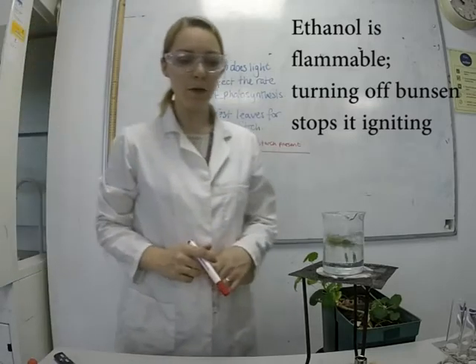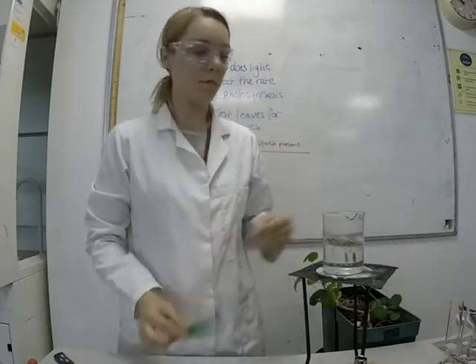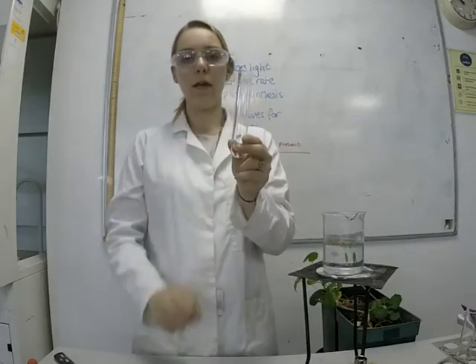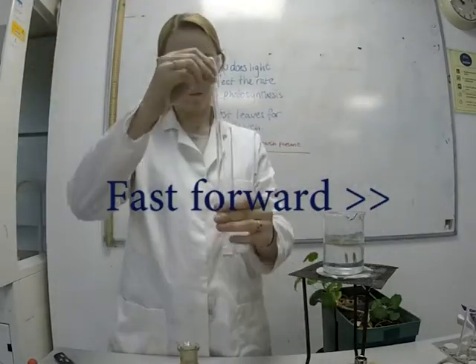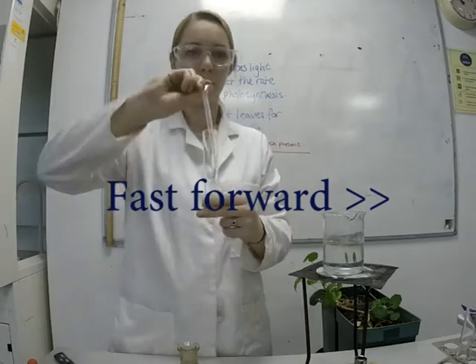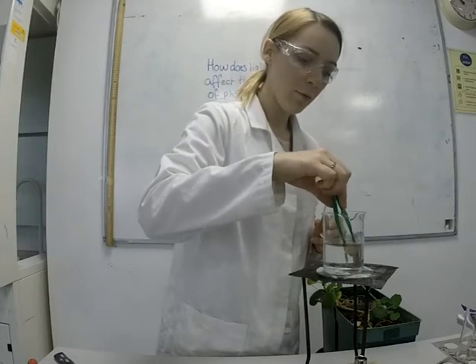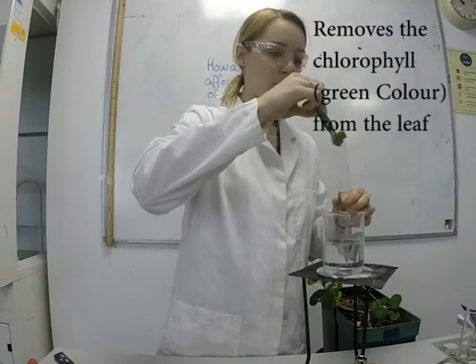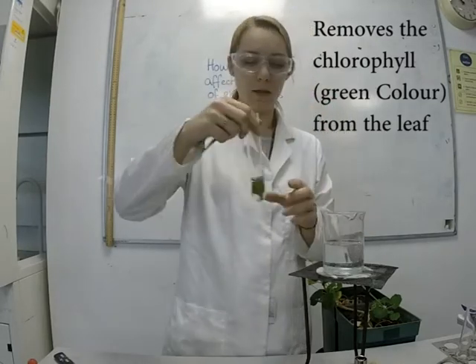Now that all the Bunsen burners are off, we can get the ethanol. Take your leaf out of the hot water carefully, then place two fingers' worth of ethanol into a boiling tube using a pipette. Using tweezers, take out your leaf and put it into the ethanol.